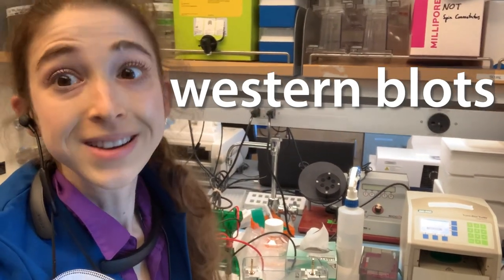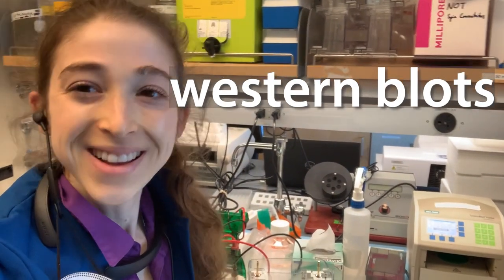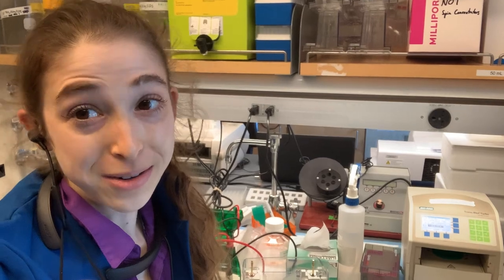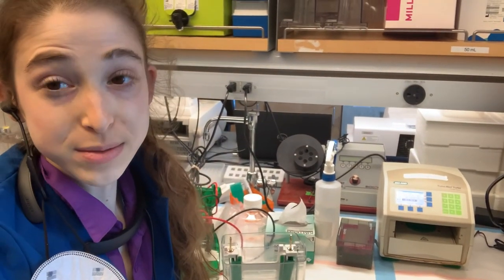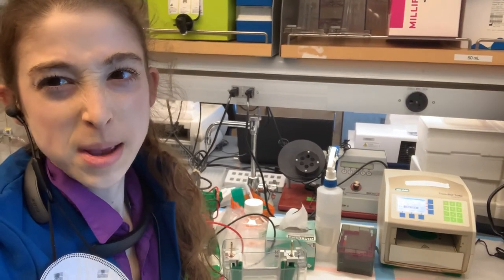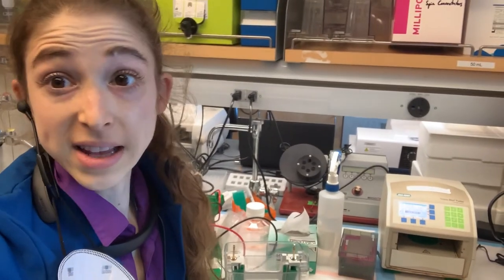Wanna do a Western? No. Gonna do a Western? Yeah. Western blots are a really useful tool in biochemistry to detect if a specific protein is present in a sample, but they take a long time and I don't like that.